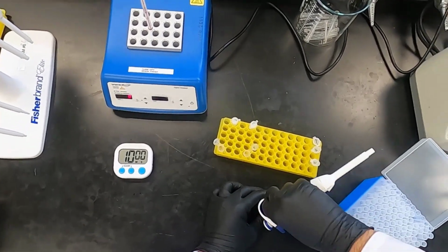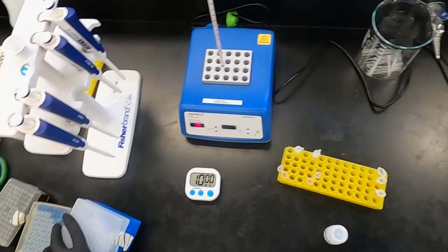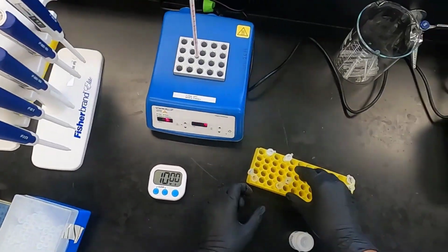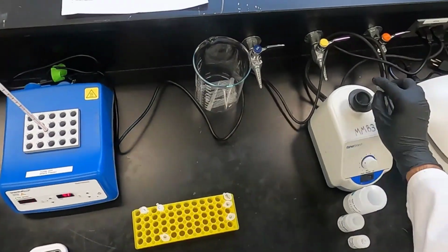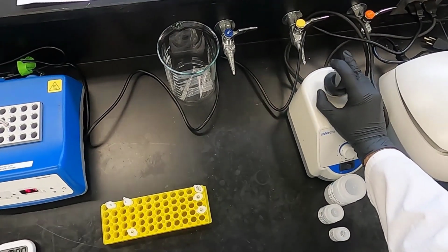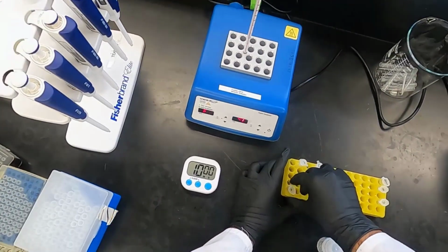Now that we've added both solutions, we're going to vortex to make sure they're homogenized. Do this with every step to make sure everything's mixed together well, so the solution is homogeneous. This will help make sure everything goes to completion.